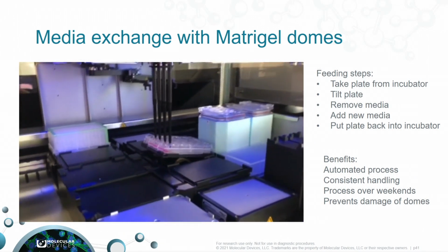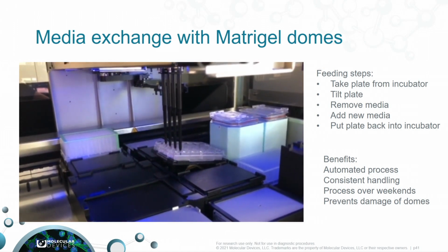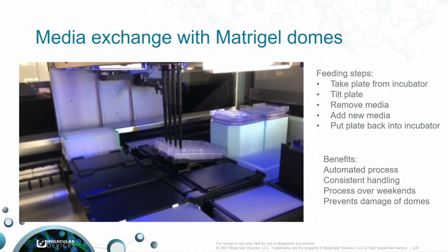And then you can also continue to feed your culture by changing media, and this is an example of that. So with this, you have to move the tips to the side, remove the media, and then put fresh ones in.